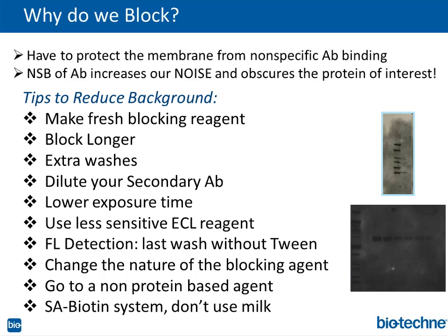I mentioned fluorescent detection. So for anybody using, say, an Odyssey system with these IR-based dyes, one thing to improve your signal is to read the membrane on the imager dry, and I think they tell you that. And then I believe they have their own blocking solution. But if you're using your own blocking solution, a lot of people will remove the Tween from the last step because Tween autofluoresces. And there are also, of course, low-autofluorescing membranes out there you might want to investigate as well. Okay, and the last point, of course, is if you're using a streptavidin-biotin system, milk has biotin in it. So imagine what's going to happen to your blot.